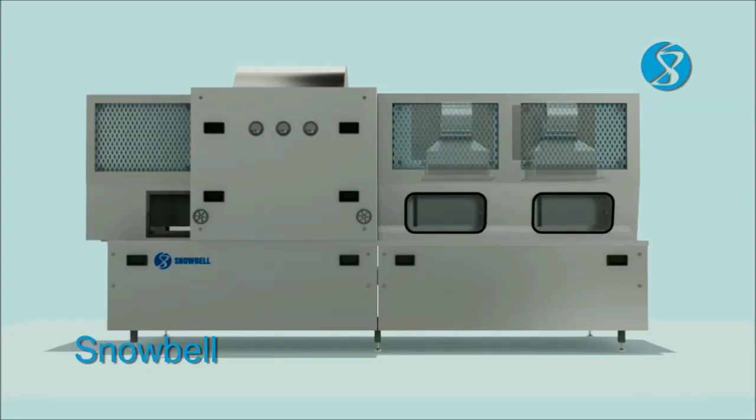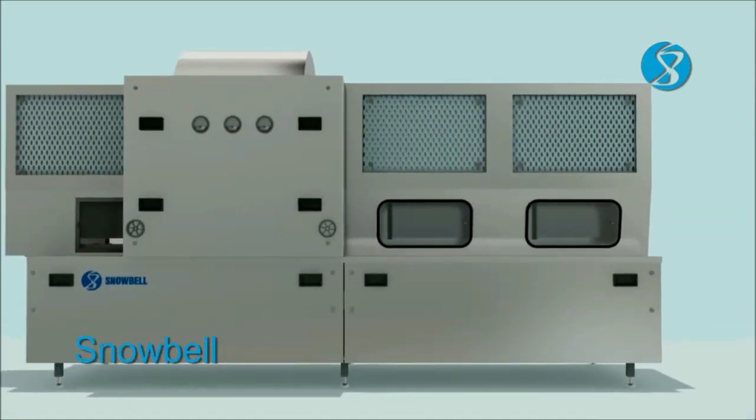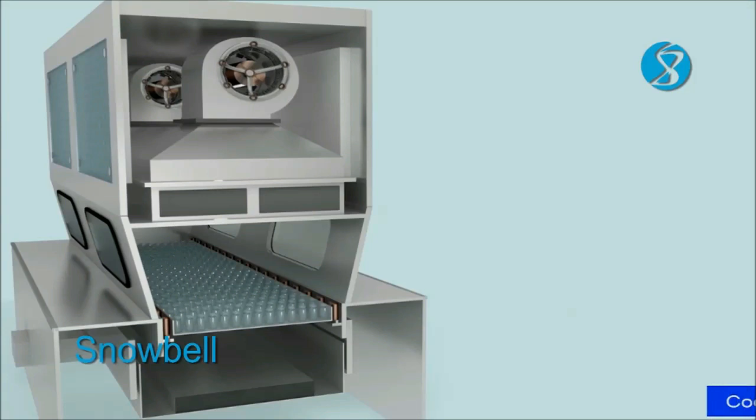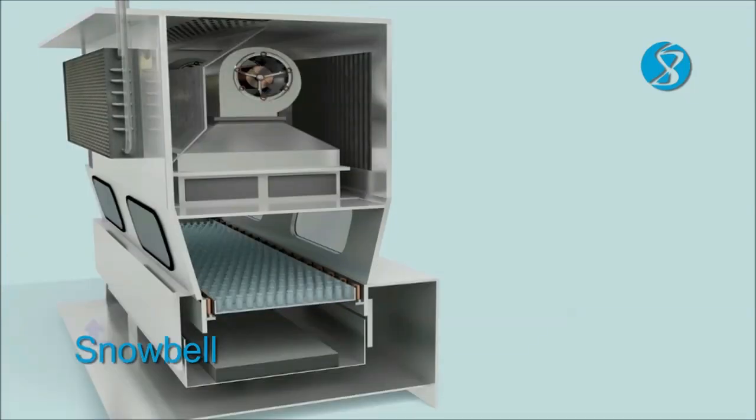Vials on exiting the sterilizing zone enter the cooling zone. Cool air is sucked in by a fan and discharged through high-efficiency sub-micron particulate air filters with vertical laminar downflow onto the vials. The recirculating fan in the cooling zone carries the warmed-up air underneath the cooling zone conveyor through a pre-filter and a cooling coil back to the cooling zone.